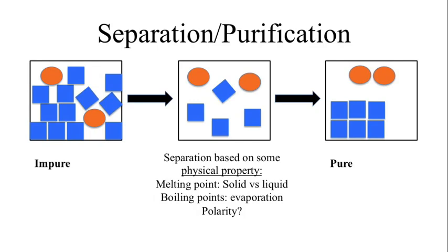Okay. We typically see decomposition of organic molecules when we heat them up enough to try and push them into the gas phase. Okay, so it's not really the best option to try and purify something, particularly if you spent hours and hours trying to get it isolated, to turn it into the gas phase. Okay, so we need to come up with another way to go about doing this.